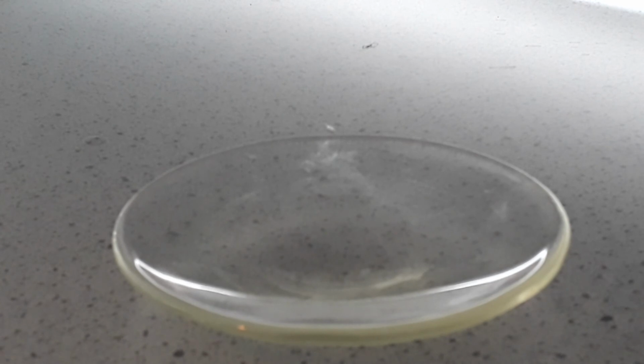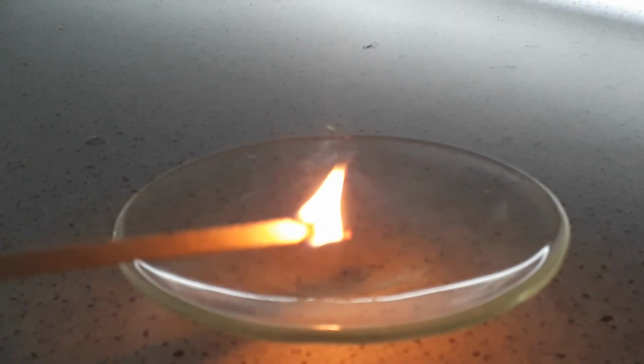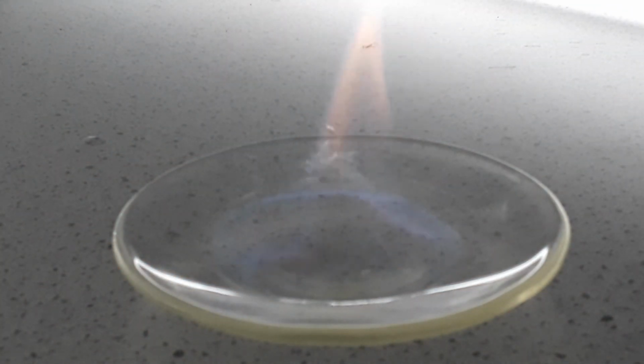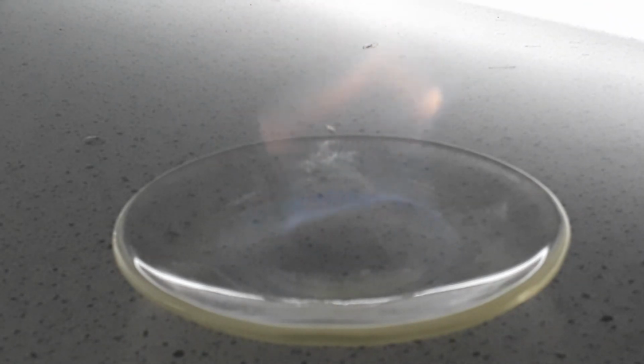I have poured the substance from the beaker into this watch glass, and as I touch it with the splint you can see that it burns, proving that it's not the water that we gained from the distillation but the ethanol.